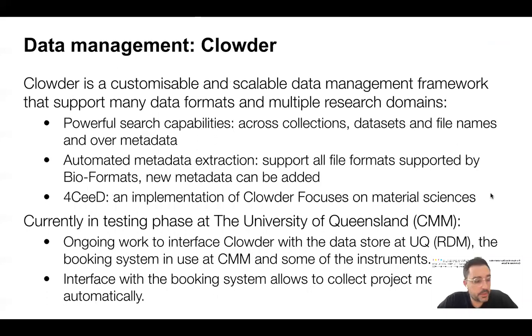And another one is the deployment of data management across key facilities. One that we're investigating first is the Clowder package. It's a customizable and scalable management framework that supports many data formats and multiple research domains, has quite good search capabilities and automated metadata extraction. And it has a particular focus through a project called 4CeeD that focuses on material sciences. We're currently testing that and deploying it at the University of Queensland, specifically for the cryo-electron microscopy community.